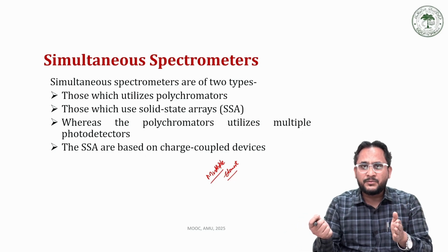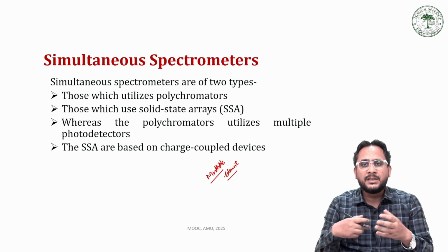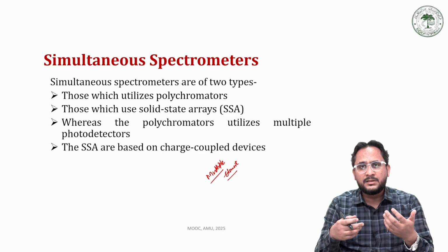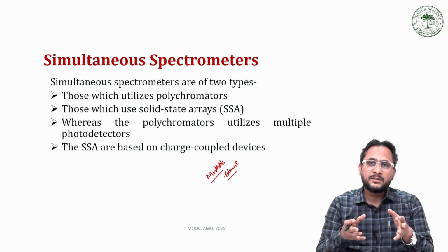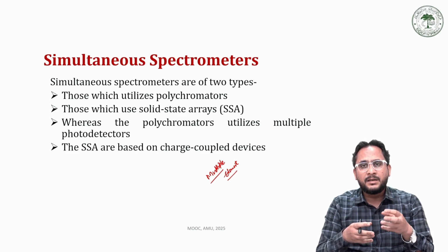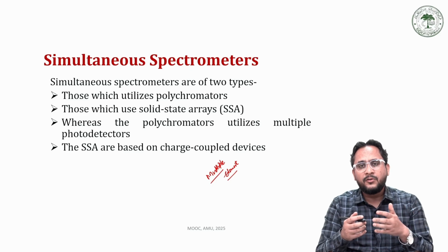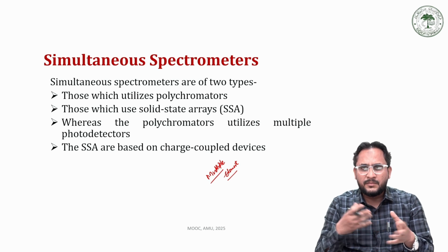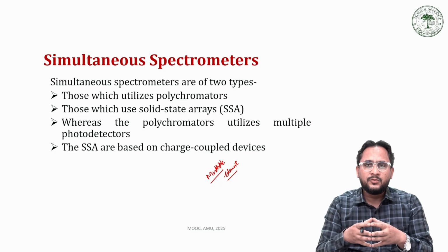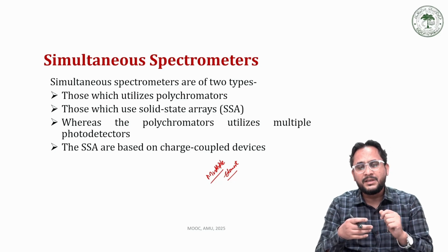Once the photocathode captures the photons present in the light radiation, it converts them into an electrical signal, meaning electrons are ejected by the photoelectric effect. That photocathode is light sensitive, and those electrons, of course, are not very accelerated, and their number is also low, so they first fall on the dynodes, which create secondary electrons, and these accelerated secondary electrons fall on the anode, creating current, and a peak is obtained. So this is how a PMT works. I just wanted to do a recap to make you realize what a PMT is.